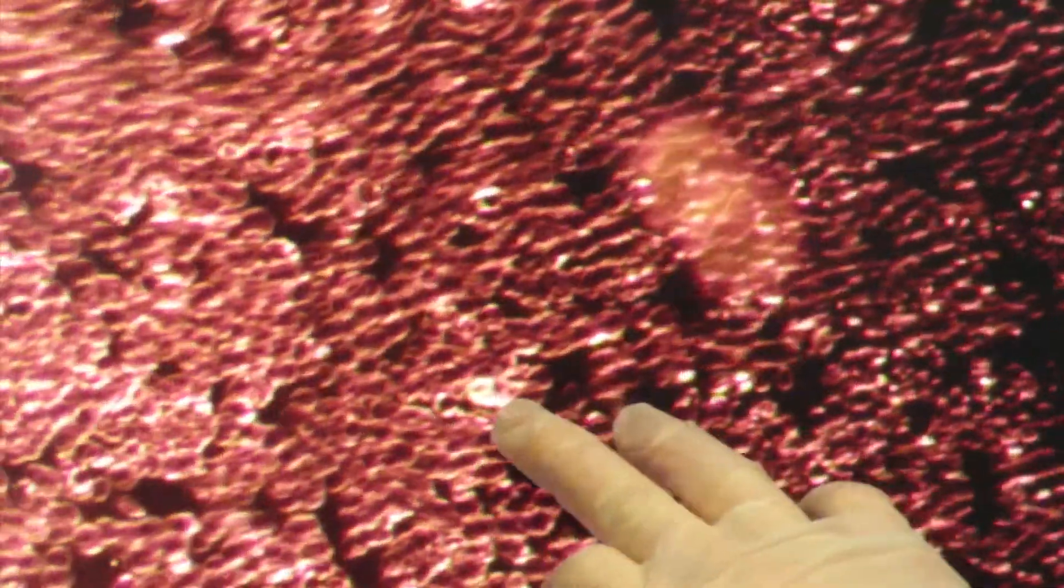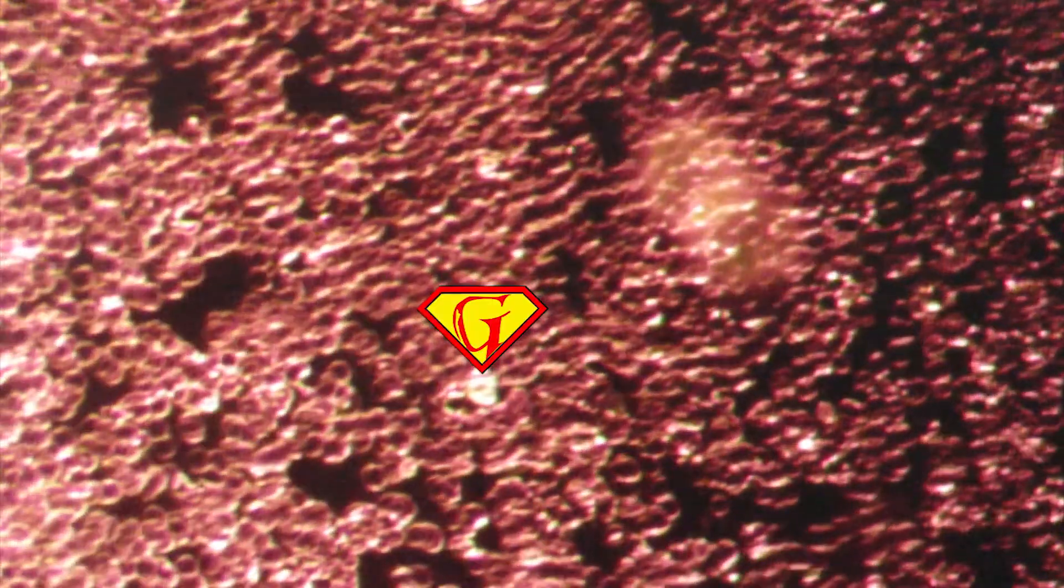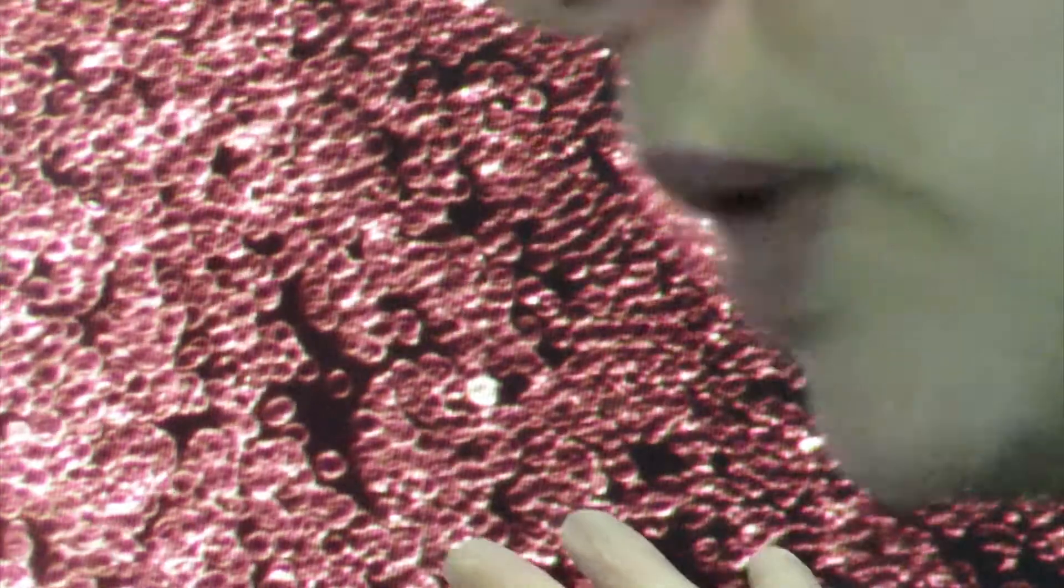We'll wait for those red blood cells to slow right down. Five to seven million cells we typically see, sometimes more than that, depending on how the sample is. But eventually, because it's out of your body, obviously it's going to slow right down. Once it slows down, we'll magnify it and go up close and personal. All the red blood cells in here, and then we also see white blood cells, the superheroes of the body.